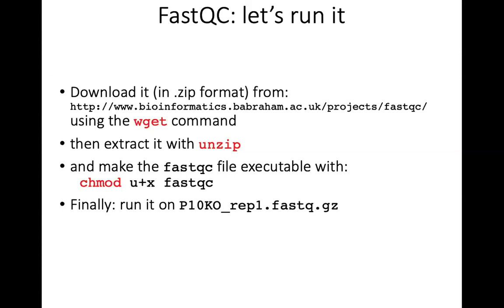Okay, so I need to be in the... Oh, okay. You see Java errors, it means the X display is trying to open windows on the cluster, which it cannot do. Is it just jumping, like the error? What is the dash issue?